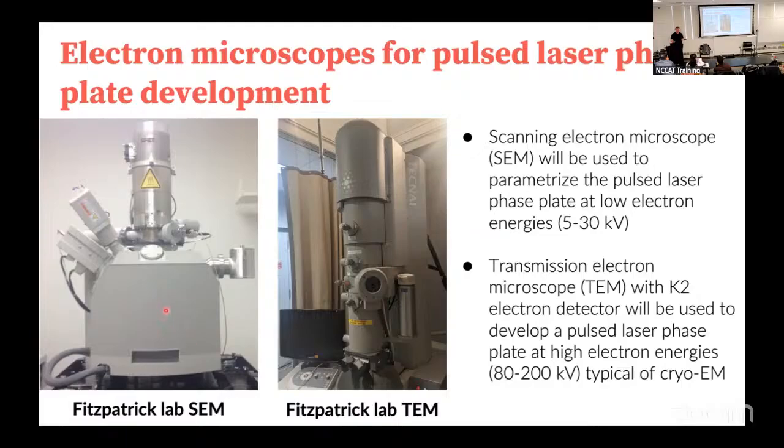And in fact, this is very similar to, I'm not sure if you'll see it, I think you will see it this week, the Aquilos instrument downstairs, the FIB-SEM, the cryo-FIBs. They basically have the same chassis where you pull out the shelf. And then inside the shelf, you put your sample. And instead of doing transmission, you are doing backscattering. So you're imaging in a different way from TEM, using secondary electrons and backscattered electrons to form an image using these detectors here. So these are your detectors.